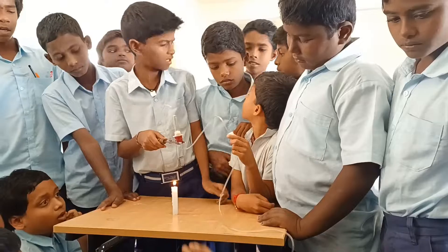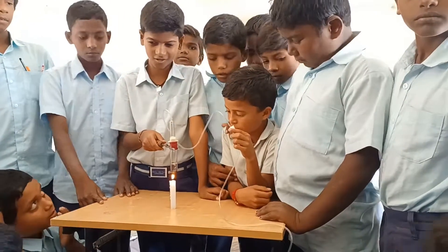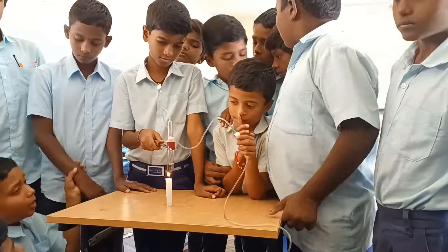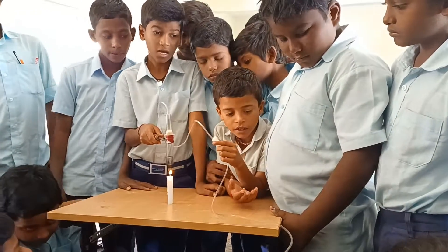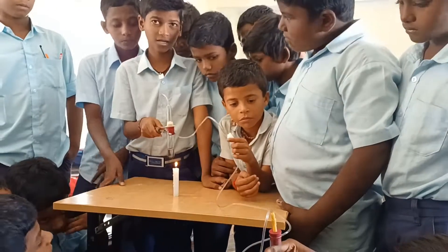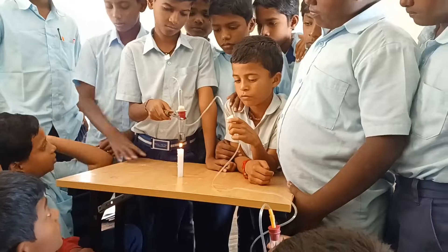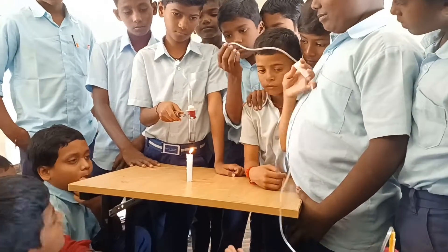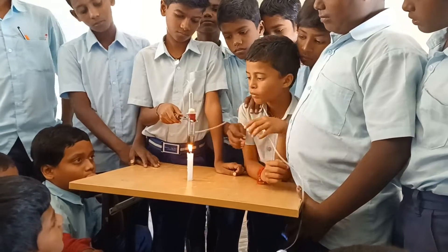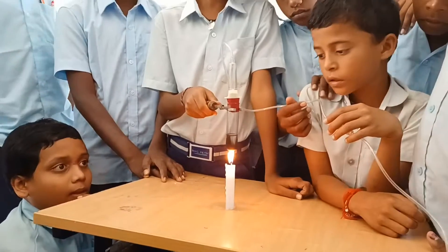For this, they used two test tubes, two rubber corks, and a saline pipe or delivery tube. Instead of a Bunsen burner, they are using a candle for heating. First, they filled one of the test tubes with normal water.